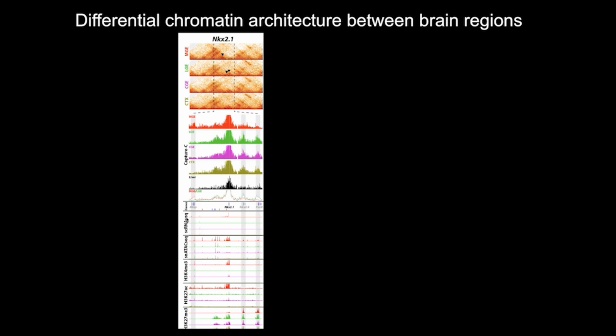And once you add in the other data we have, single-cell RNA, single-cell ATAC, the various methylation, histone modifications, you can really have a complete story, both at the single-cell level and in the bulk chromatin level, to understand both the RNA and the gene regulatory mechanisms.